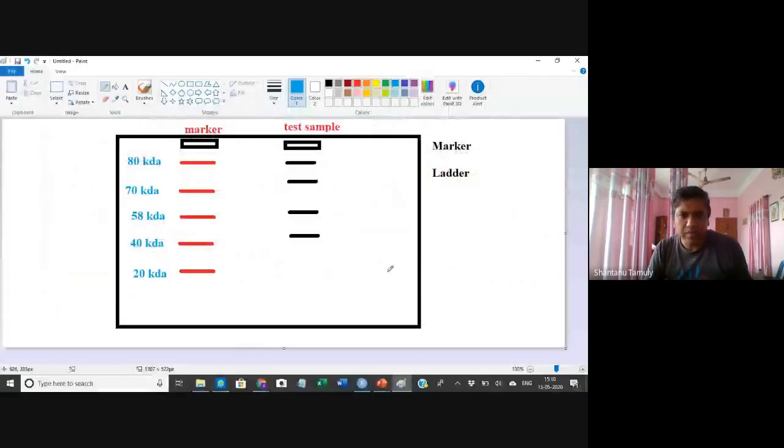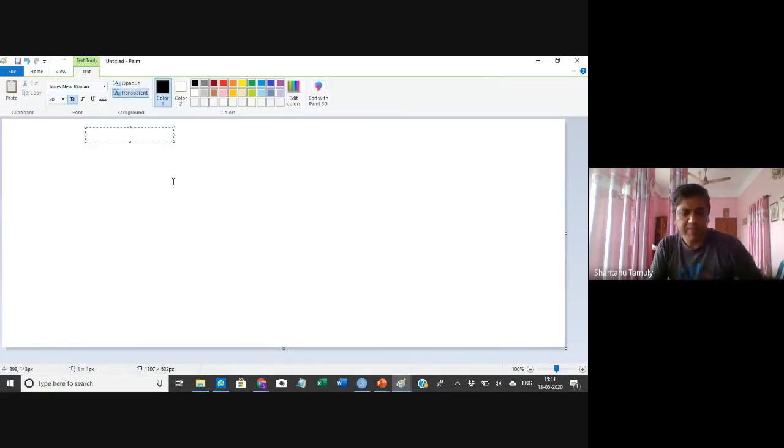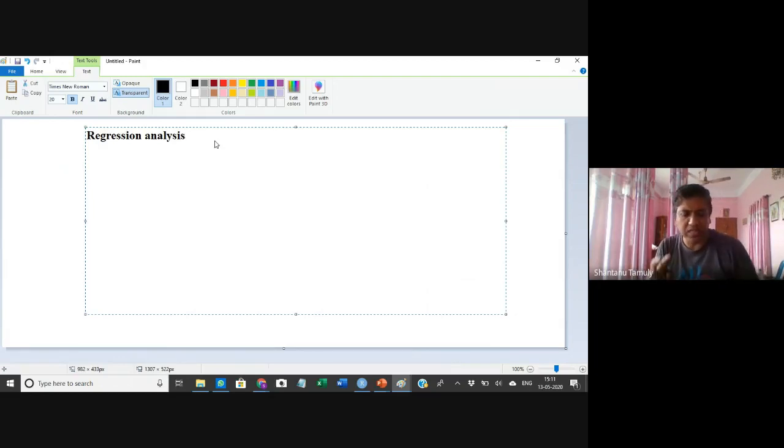Now, regression analysis. Let me open another window. You are familiar with this term. In regression analysis, you have two things.